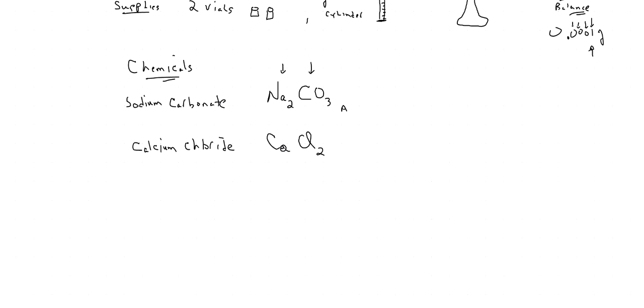AQ, I'll write it here, just so we know. AQ means aqueous. So it's in a water solution. This compound is in water, okay? So I try to be careful with the aqueous.